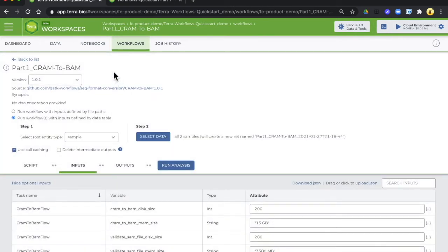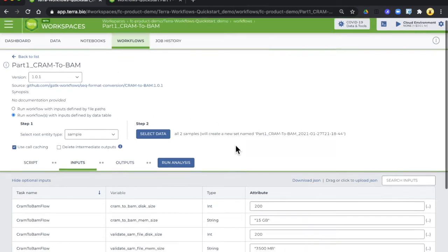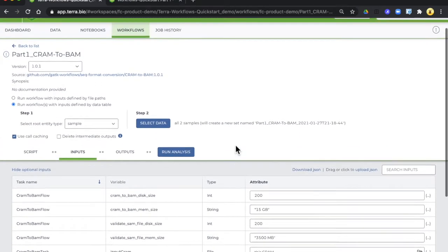When you click on the workflow name you'll be taken to this configuration form which is where you will do all of the setup inside Terra.